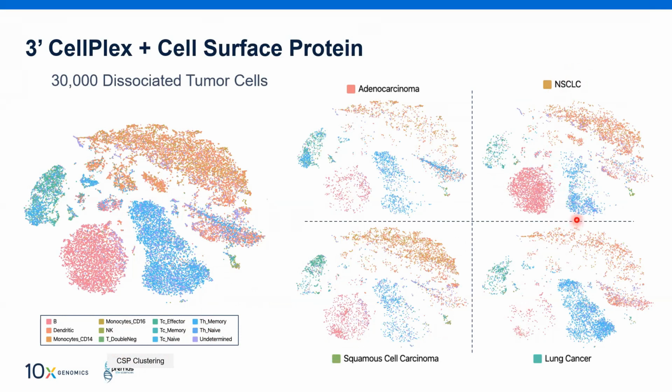And in the undetermined lung cancer, you can see the T cell population is very high. That means this is not a non-small cell, this is something else, which is evident from this particular data set. And it is also not adenocarcinoma, small cell, or squamous cell carcinoma. So we have a more detailed view of our sample when we are doing single cell technology.